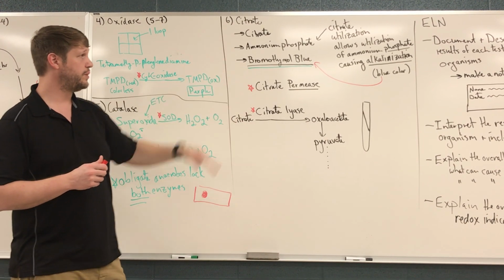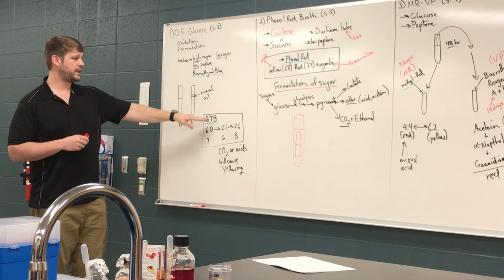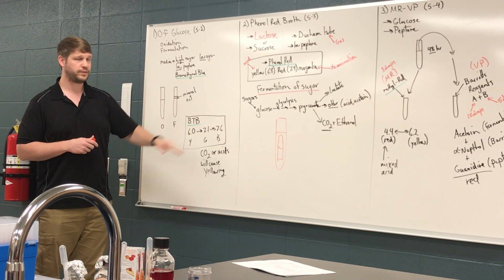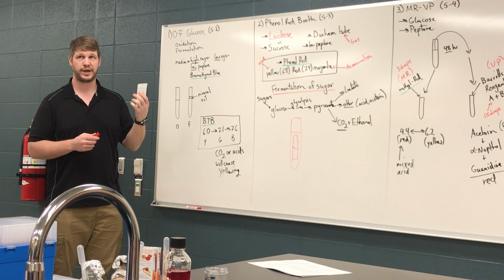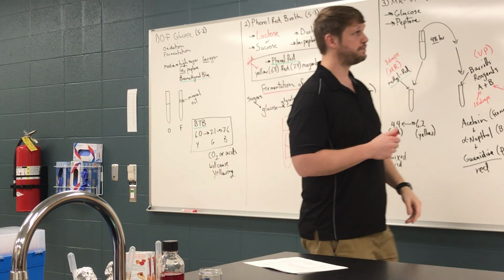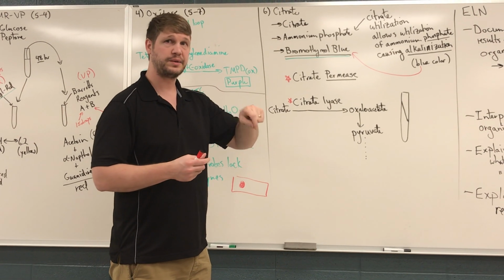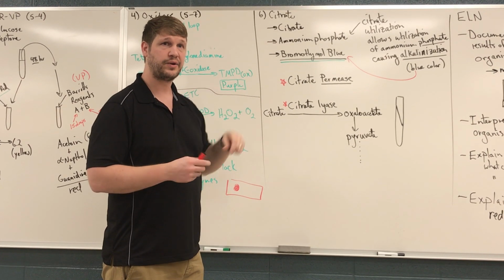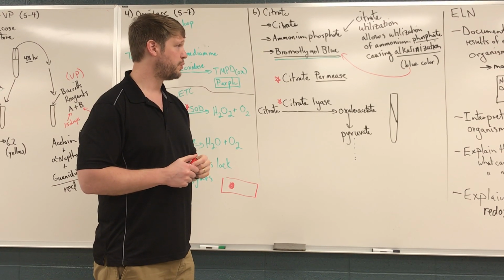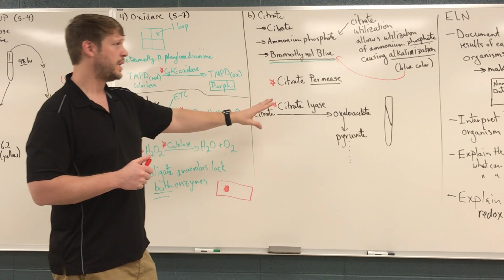The bromothymol blue, this is the same bromothymol blue that we were talking about over here. So the citrate agar is going to go from kind of a greenish color to a really bright blue color if it's utilizing citrate. Okay. These are poured as a slant, so do the drag, right? Drag inoculation with your loop, but it should be pretty straightforward. Any questions about that?